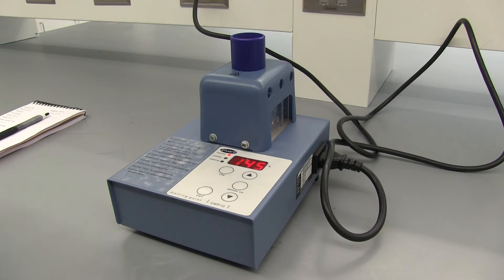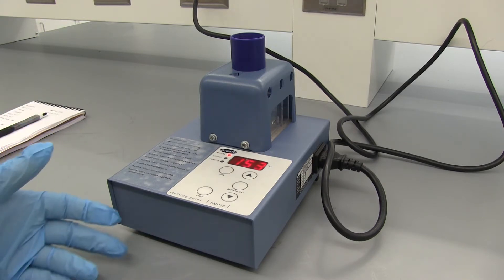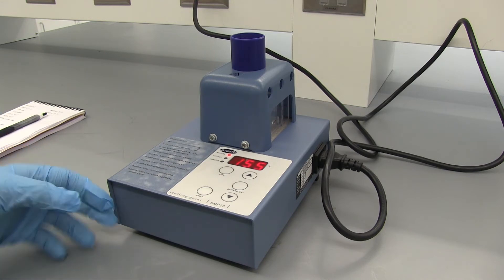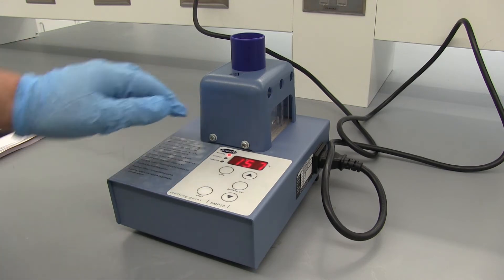Alright, so our fast melting point started melting around 126 degrees Celsius and ended around 131 degrees Celsius. Our fast melting point is going to be a little bit high usually because it takes a bit of time for the heat to transfer from the heating block to the sample.